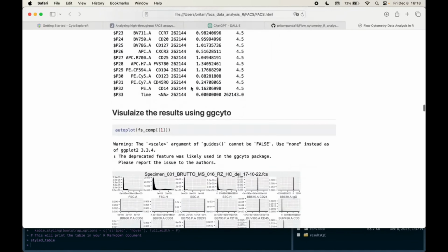Also look into the execution of the packages. For instance, if you go here, this is the code, and you can see flow set with 1 experiment, because this is the parameter I have used, and then fs flow set with 5 experiments. So you can look into the code and then look into the outputs as well.